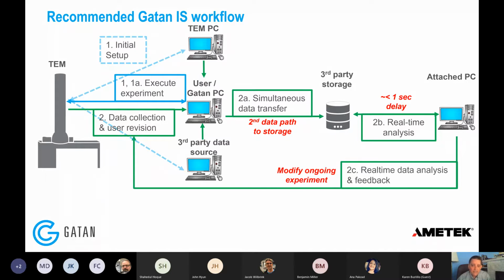So in this case, there's really only two steps, right? You have to set the thing up, and then you start collecting data, and all this is done on the fly. So you can imagine that this provides a lot more flexibility to the scientist who's collecting the data. You have a better chance of success, and you can make changes on the fly.